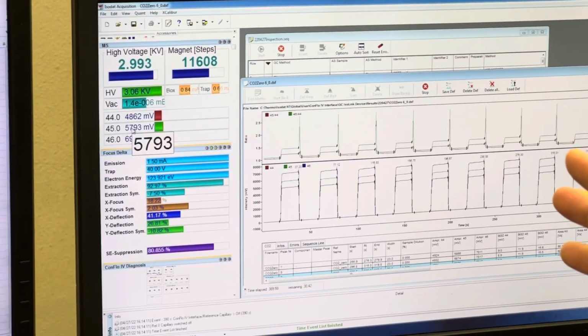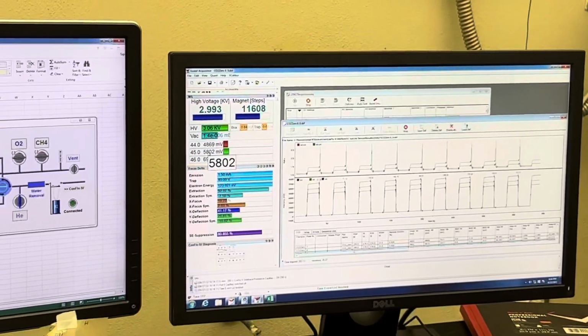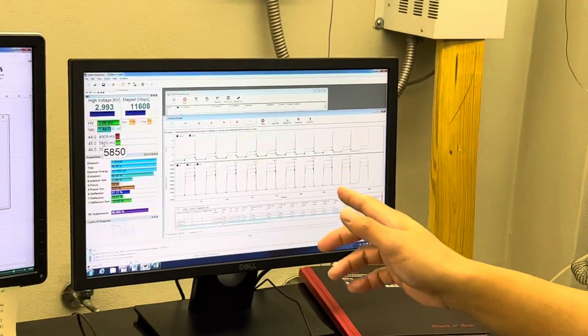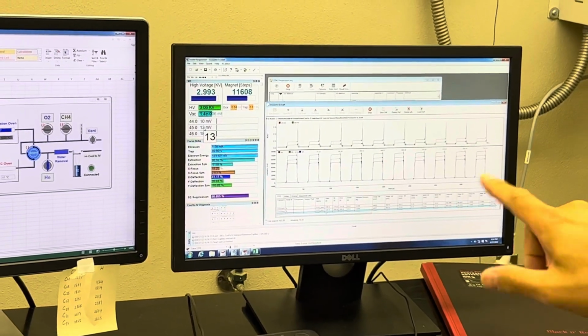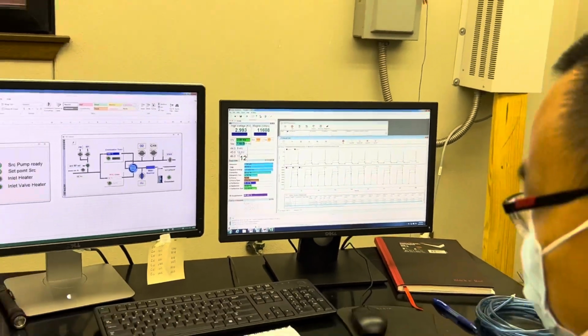pass to the gas configuration. We do this argon background check and 18. Okay. That's how we did before. Cool. But we didn't do it for the other cup, 28 or 44.